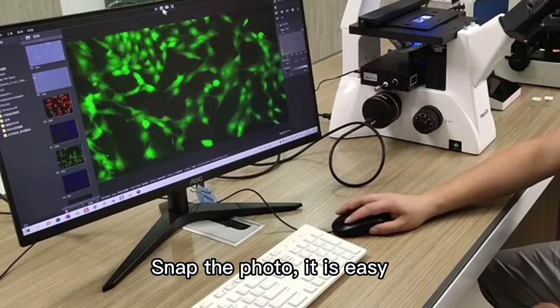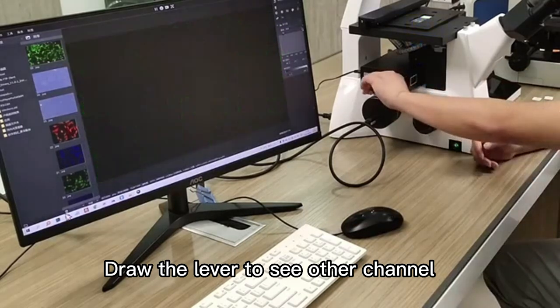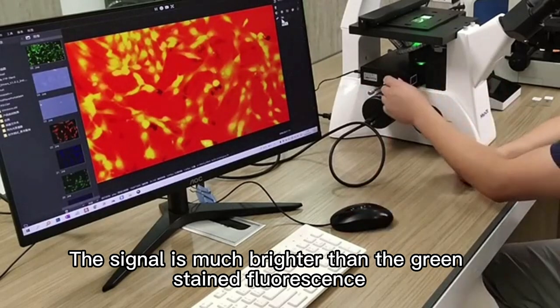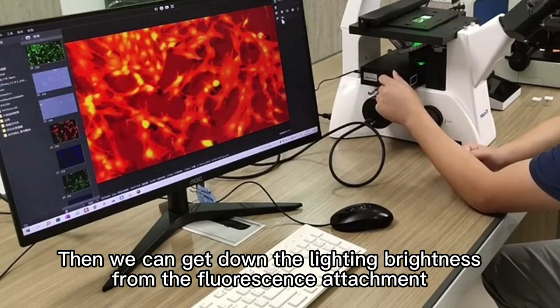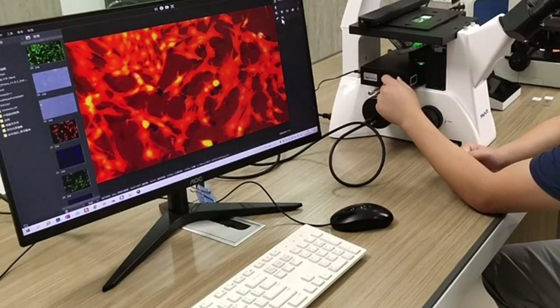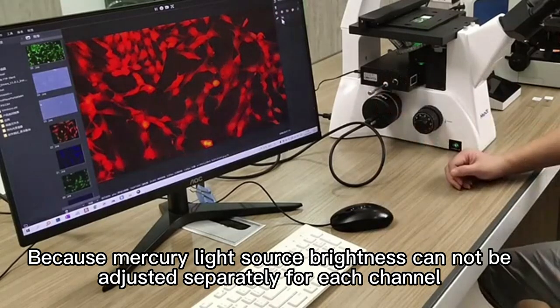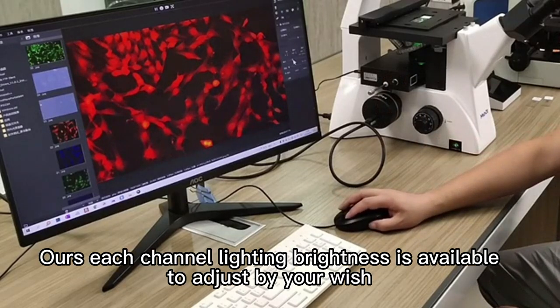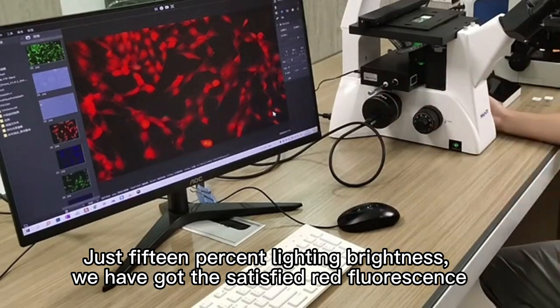Snap the photo — it is easy. Draw the lever to see another channel. Now we are looking at the green channel, where you can see red and yellow fluorescence. The signal is much brighter than the green-stained fluorescence. Then we can reduce the lighting brightness from the fluorescence attachment. That is the advantage of our product compared to a mercury light source, because mercury light source brightness cannot be adjusted separately for each channel. With our product, each channel lighting brightness is adjustable. At just 15% lighting brightness, we have got satisfying red fluorescence imaging. Snap the photo.